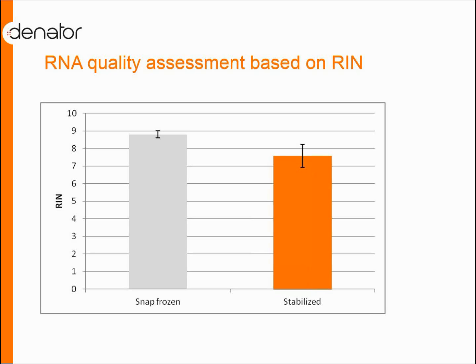They do denature, but due to their small size, and they're also held together, I think by 4 disulfide bridges, they tend to refold into a functioning shape, so they can continue degrading RNA afterwards. So it's not like the examples where we see the phosphorylations, where heat-stabilized samples can be left at room temperature. That cannot be done with RNA.